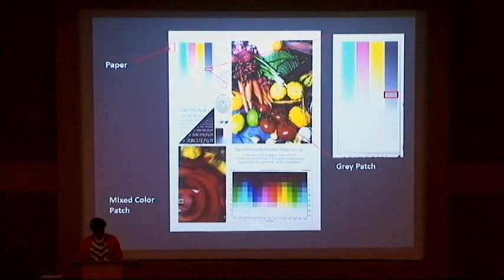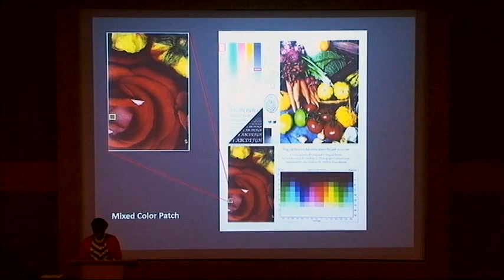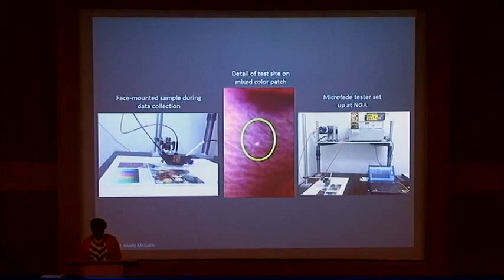In consultation with Dr. Manis and Dr. McGath, determinations were made on the testing sites and which ones would be appropriate. Three sites were chosen: the paper base, a gray color patch, and a mixed color patch. The approach to testing adhered to a philosophy of gathering comprehensive and inclusive data first. For example, testing a gray patch containing all image-forming material would inform the stability of the image materials as a whole. When or if a material exhibited sensitivity or an unpredictable response, then one may proceed with isolated color or dye-specific test sites to identify the dye or colorant exhibiting fugitive properties.